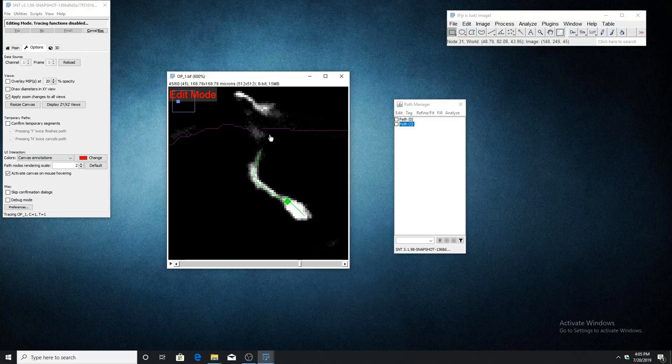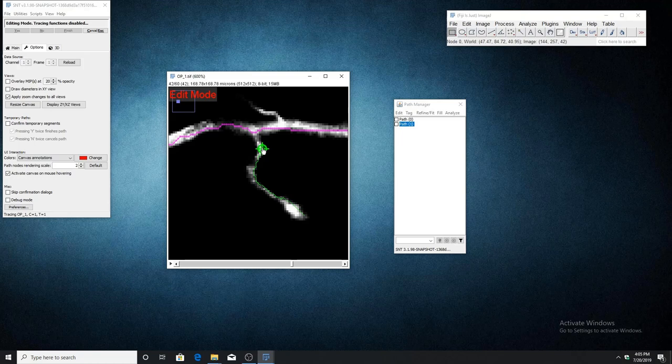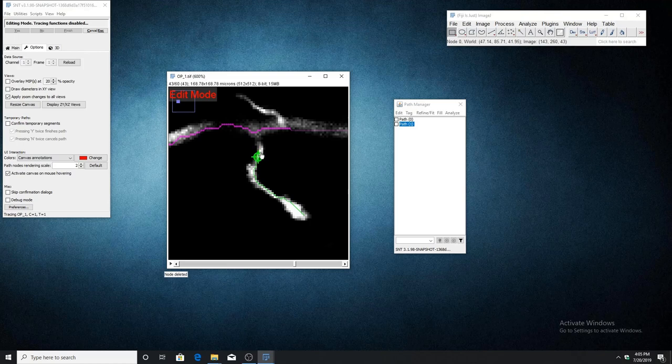To delete a node, first hover over the one you want to delete in order to activate it, then press D on the keyboard and this will permanently remove that node from the path.